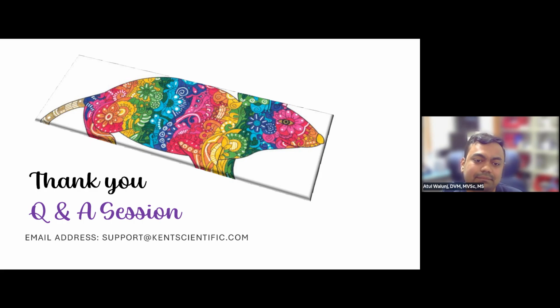Towards the end of your presentation, you mentioned the pad temperature. So, what would the pad temperature be set to in order to maintain 37 degrees Celsius animal temperature without burning the animal? If we are talking in terms of the FIR warming pad, the pad temperature should be maintained somewhere from 37 to 37.5 degrees.